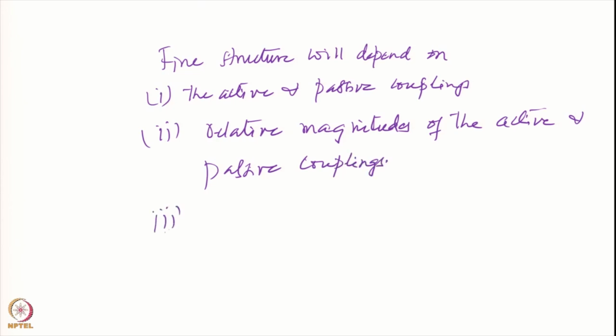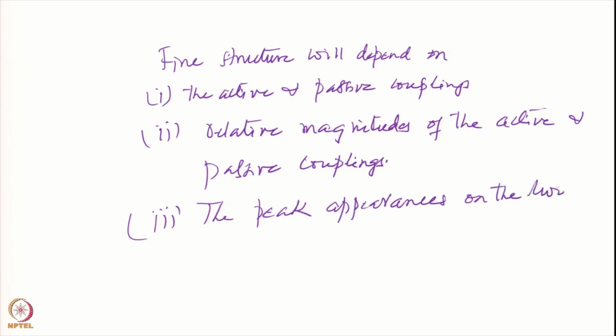Third, the peak appearances on the two sides of the diagonal will be different.